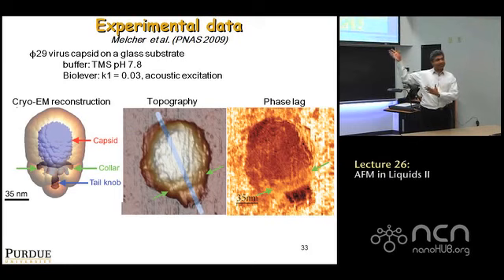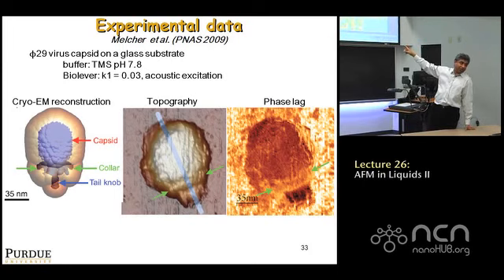That figure is just shown because whenever you show high resolution images of viruses, people like to see whether that's real or reasonable. And for viruses, at least for bacteriophages, you have cryo-EM based databases that tell you exactly what the shape is. The whole point of that thing on the left is to point out that you cannot typically compare the structure of a virus taken from cryo-EM to the structure you get from AFM, mostly because of tip convolution.